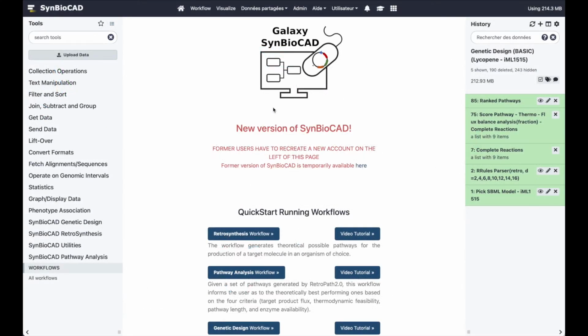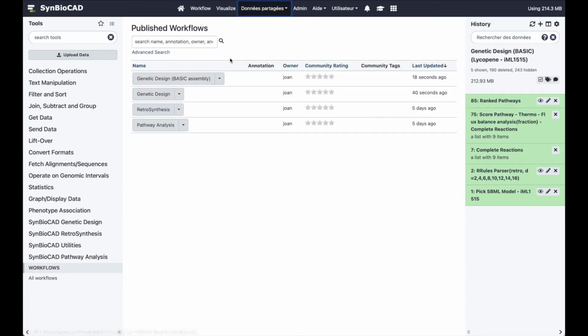To run the Genetic Design Basic workflow, go to the Shared Data menu and select Workflows. Then choose Genetic Design Basic, click on it and choose Run.